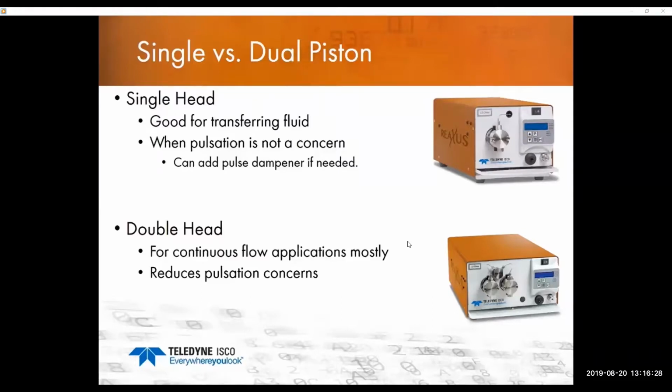Lots of times we'll talk to people who use multiples of these to feed different chemical agents or chemical reagents through a flow chemistry application, where all they need is to move it in there at a steady rate. It's got to come in on the left side at 10 mils a minute, on the right side at 5 mils a minute, and then in from below at 3 mils a minute. So it just gives you a very nice, even flow, okay?